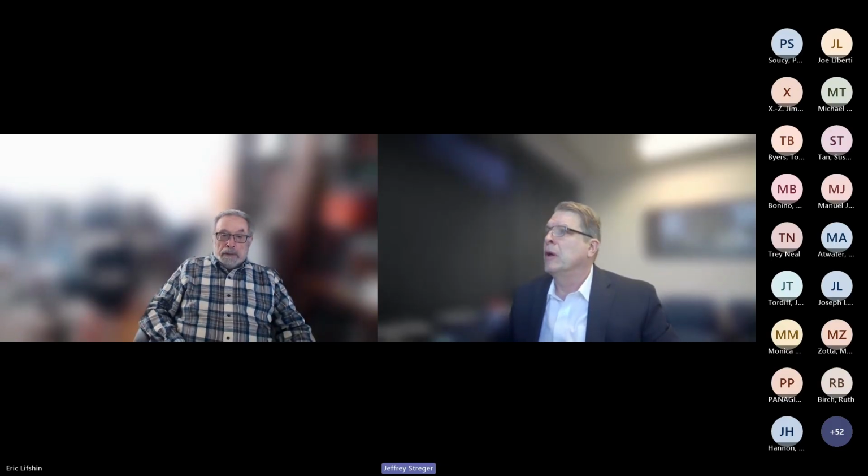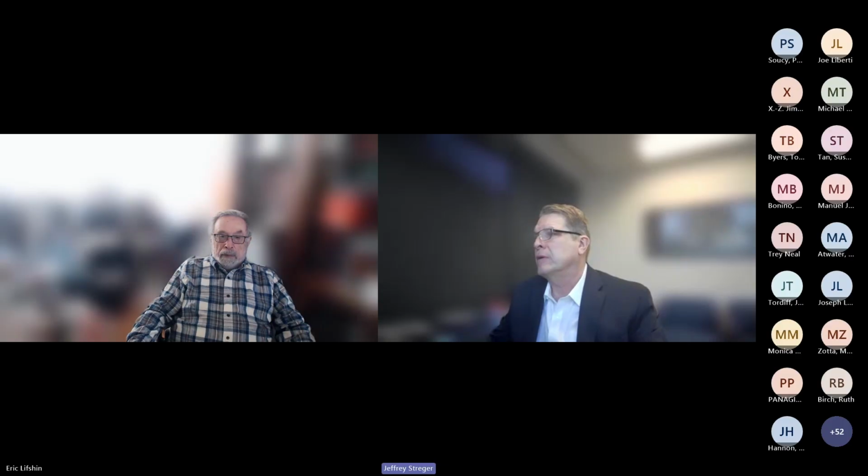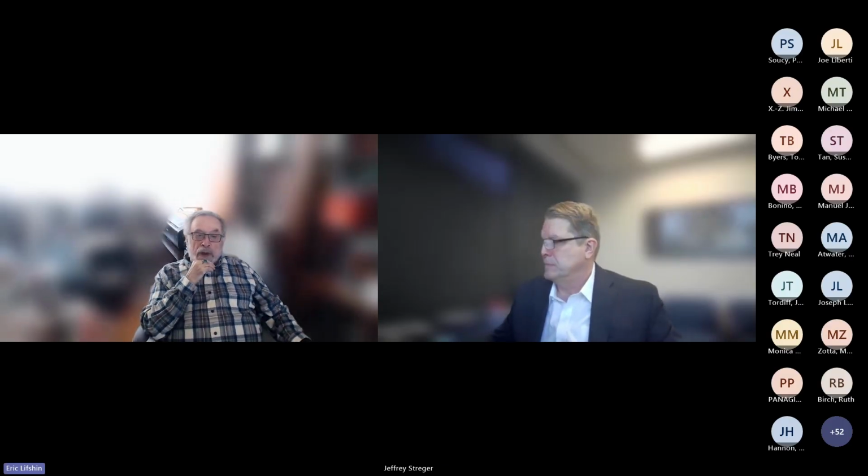Very good question. This is from Benjamin Ward. What is the state of uncertainty quantification for EDS? Are there commonly identifiability issues in EDS data? Yeah, I'll try to answer that one from a couple different angles.